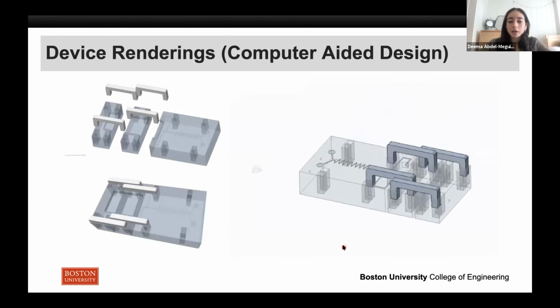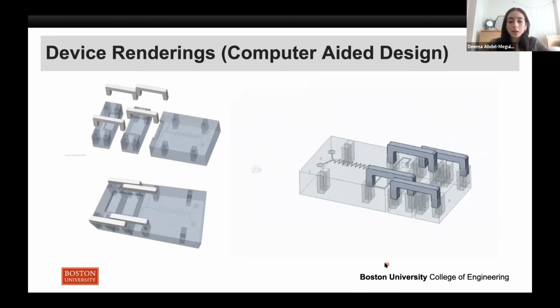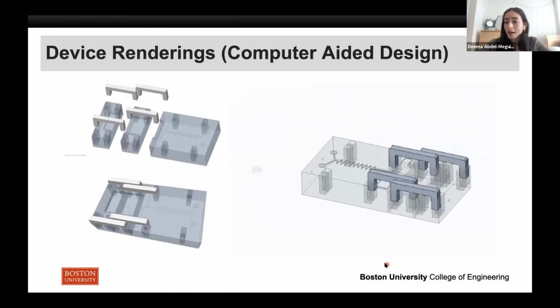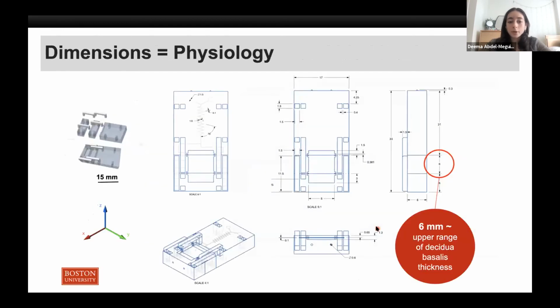These are the renderings I developed for our device using Creo, which is a computer-aided design software that can later be used to manufacture the device. You'll notice our device has 3 separable compartments, and the idea is that in the future, researchers can actually rearrange compartments or even add more to increase the testing variables. And just a brief comment on our dimensions, you can see on the left just how small the device is. Dimensions were chosen very carefully based on the environment in vivo, and this technique is consistent with how organ-on-a-chip models have topographical similarity to environments in the body.